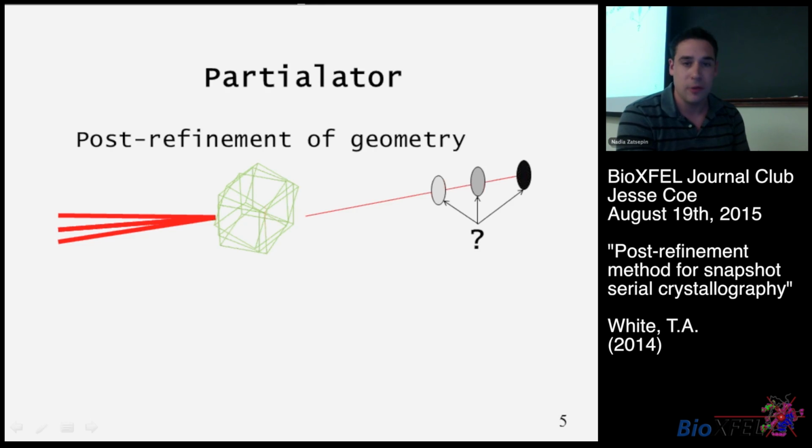This would lead to different intensities, as evidenced by the gray and black spots on the right. So we would essentially see the same spot. We know which HKL value it is, but we don't know what percentage of the full intensity we could be measuring it is.